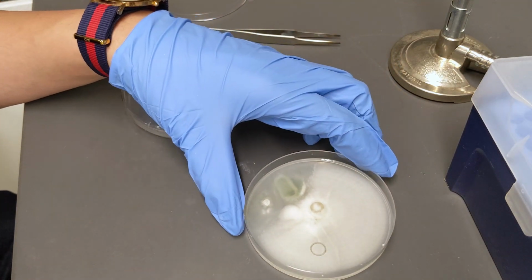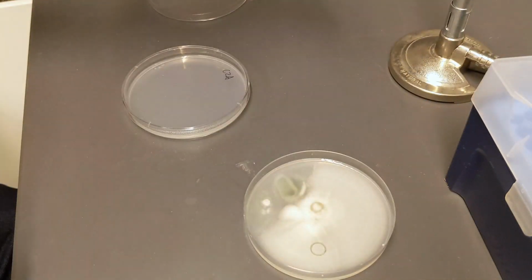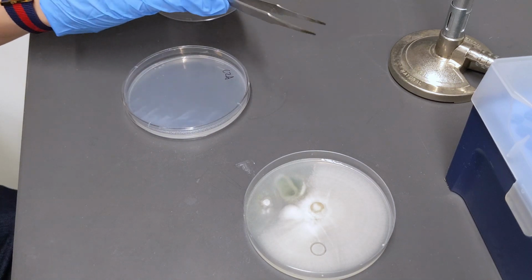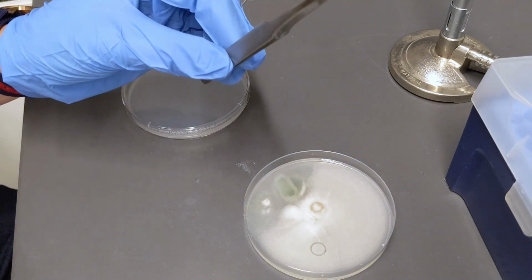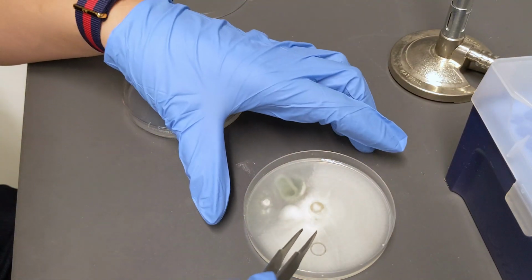Then we use clean tweezers to pick up this small piece of agar, whose surface is full of the spores of P. rubens. Keep in mind that this pair of tweezers has been cleaned with ethanol and heated on flame to sterilize.